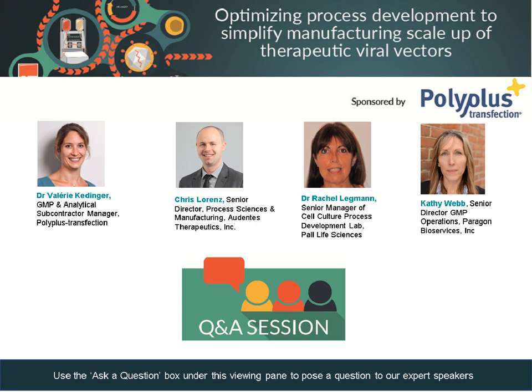And then Kathy, coming to you. Hi, good morning, everyone. I think a lot of what you've just heard does describe a lot of what the bottlenecks are. In the presentation, there was a nice display of the different factors that do lead into the efficiency of the transfection. Being more on the GMP side, we definitely work closely with our process development team, and we work for methodologies that will scale up to our production level. But thinking about those things early on, how you want to standardize and think about what your ultimate end goal is definitely something that is best to think about as you start developing your process.